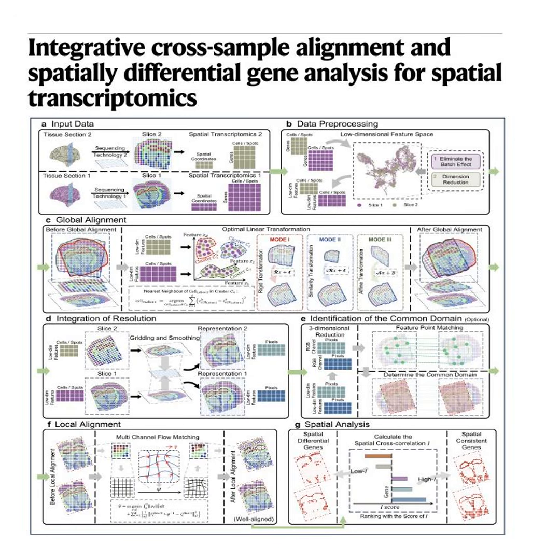Yes. And this goes back to what we discussed earlier, CODA's image-based design. Because it converts the complex spatial coordinates into an RGB-style image and uses computer vision AI, it sidesteps the incredibly heavy mathematical coordinate calculations that bog down the other tools. It's elegantly lightweight. So because it was so light on memory, they didn't have to shrink the data set. Exactly. They were able to run CODA on the full, unshrunk 100,000 cell data set. It processed the entire thing in just 510 seconds, about 8.5 minutes. Processing 100,000 cells in 8 minutes on standard RAM completely democratizes this technology. I mean, any standard university lab, any regional hospital could eventually run this.